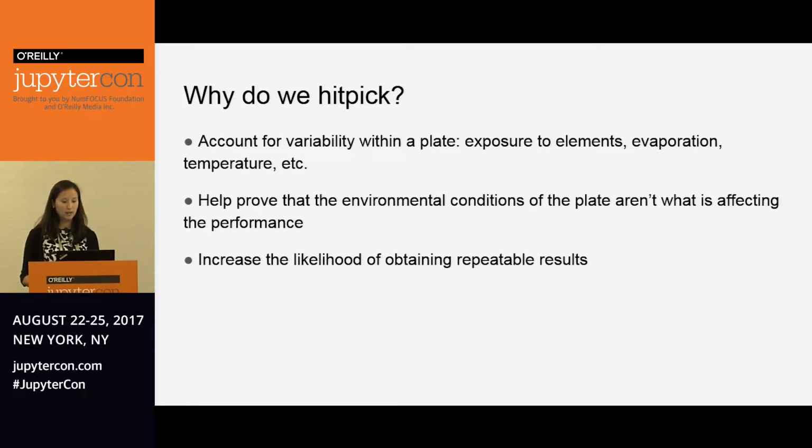So we want to move these samples around our plate to prove that the environmental conditions of the plate aren't what's affecting their performance, because we want to see how these strains are going to perform. And we want to increase the chances that if we see a strain that's performing well, it's performing well because it's a good strain, not because it happened to be in a part of a plate that had conditions that it liked to be in.